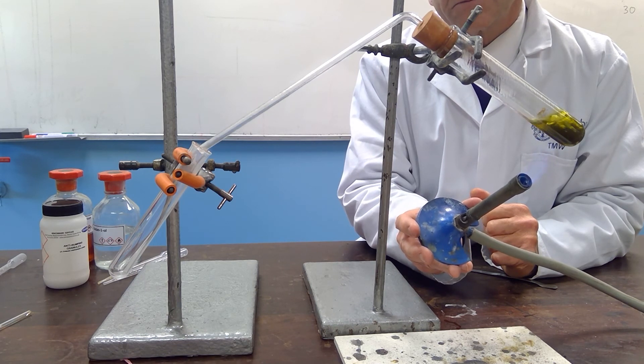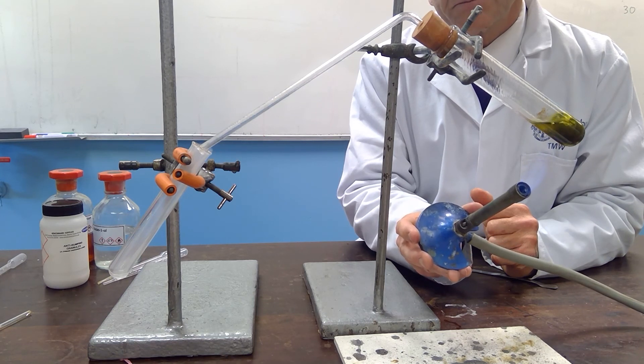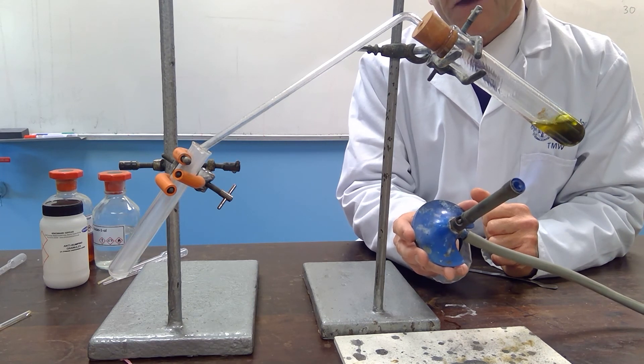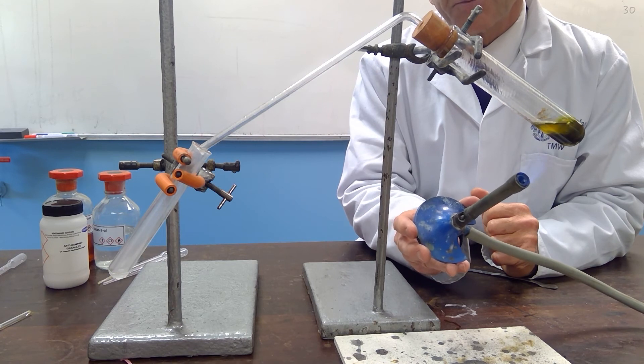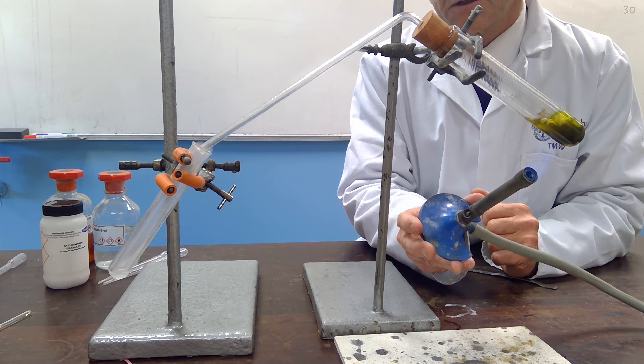I think some of it would be still as vapor. However, the method of condensation is not as good as a Liebig condenser, but still, there is plenty of distillate coming across, as I hope you can see.